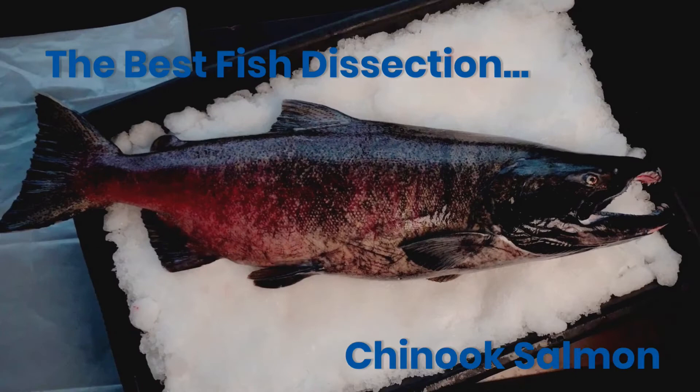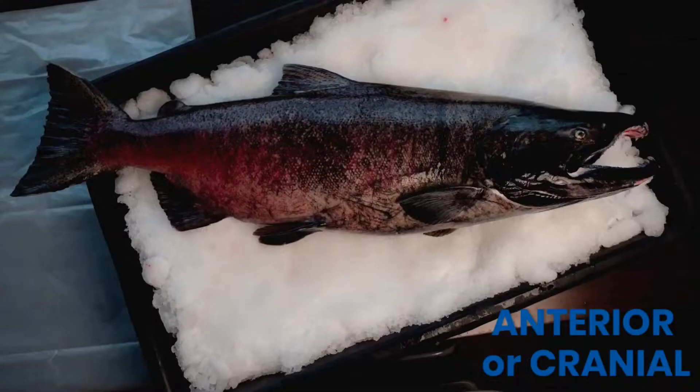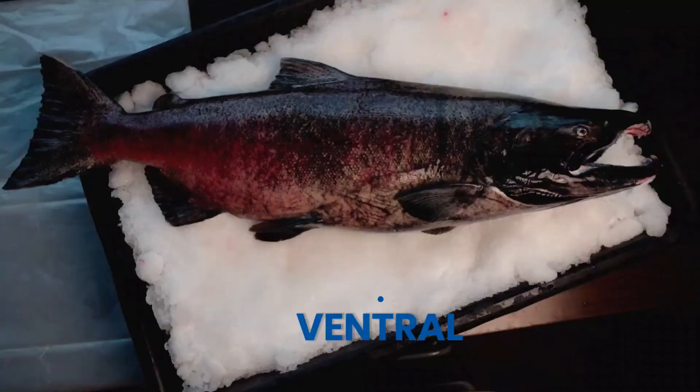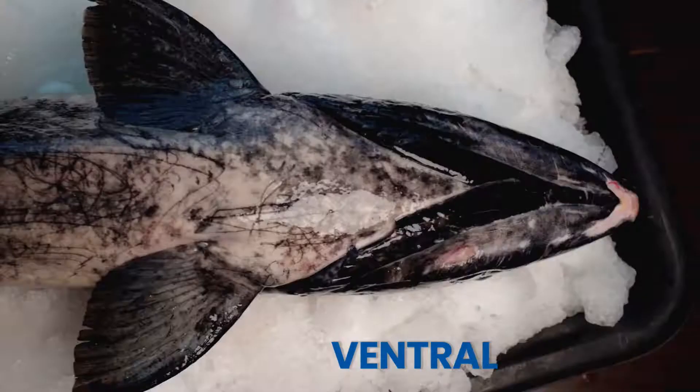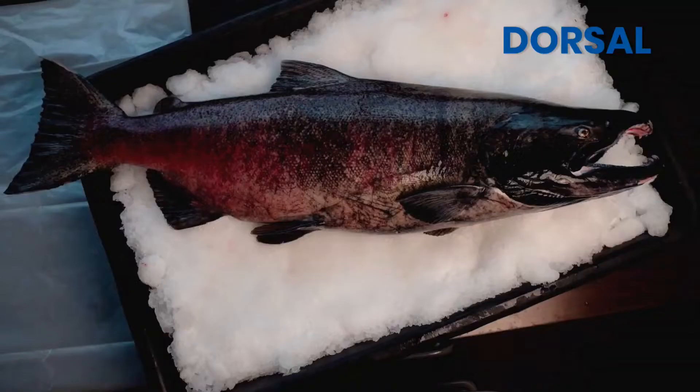Now let's get this Chinook Salmon measured and label the axes of a fish. Speaking of cranial, you're going to want to stick around until the end of the video to see the fish brain. This King Salmon had a total length of over 3 feet.